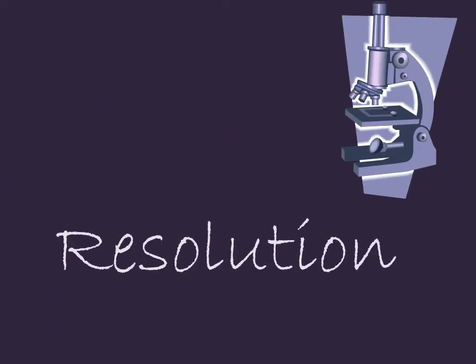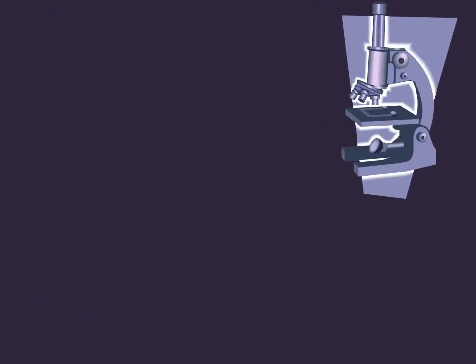Okay, let's begin with resolution. Imagine you have 2 points that are an x distance from each other. Are you still able to see 2 points? Now, as the distance keeps getting smaller between those 2 points, it begins to be harder to tell them apart as 2 points, to the point that they might seem part of the same object, or they might appear as just one object instead of two if they're very, very close together.